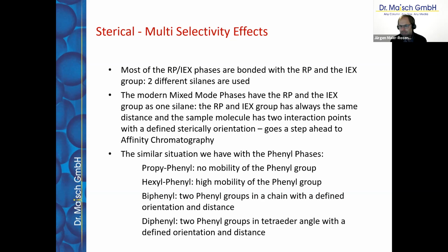Some of the manufacturers are saying that the hexyl phase is the better phase, but that's not true. You never know which one is the better phase. It strongly depends on the application and the molecules you want to separate. Both phases are important, and both have their possibilities, so there is no better one. Yes, both can lead to success.